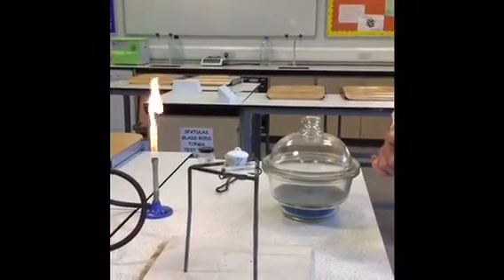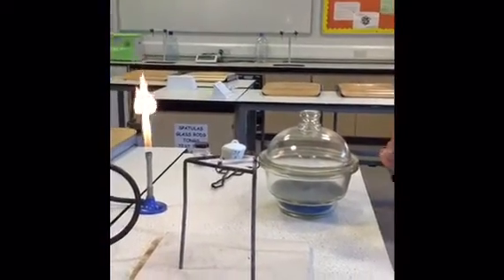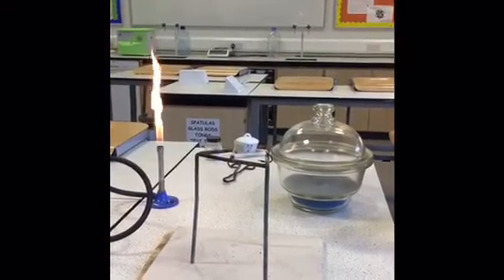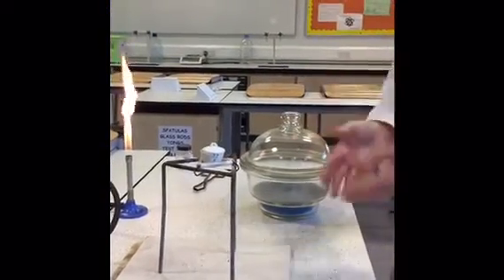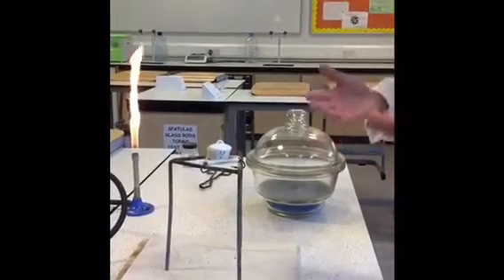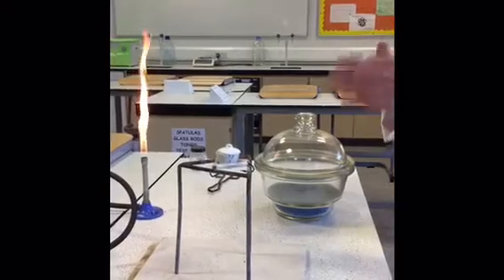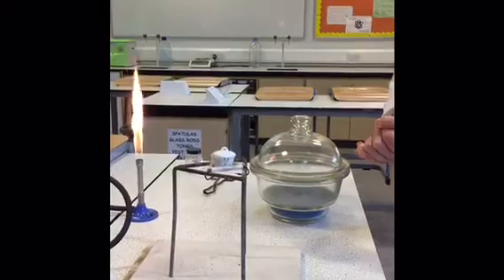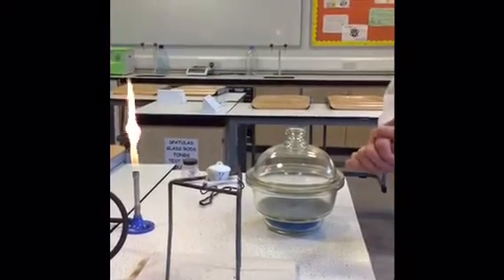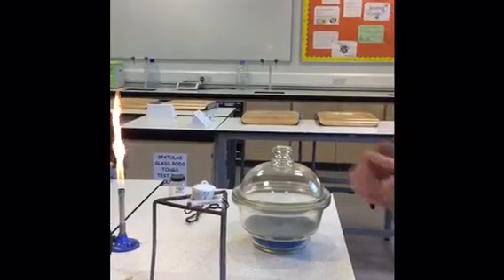Okay, so we've now heated it for 10 minutes and I've just let it cool down a wee bit, and what we want to do now is weigh it. However, because it's still very warm, if we put it onto the balance, convection currents produced by the hot crucible will actually interfere with the weighing process. So we have to let this cool down to about room temperature before we weigh it. Now the problem with that is that as it cools down, it can reabsorb moisture from the atmosphere. So to stop that happening, we're going to put it into this desiccator.